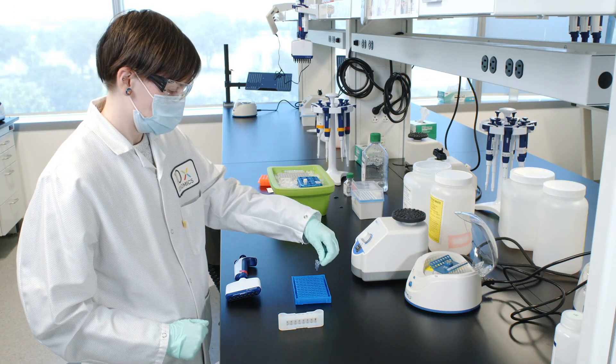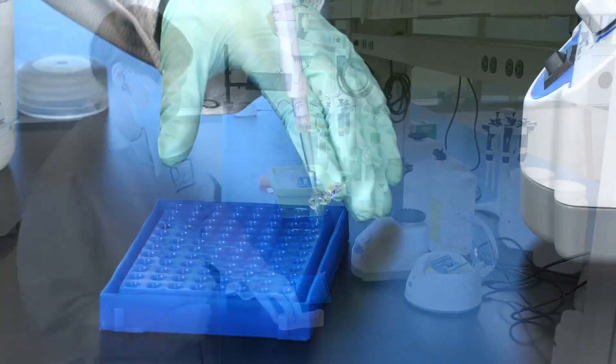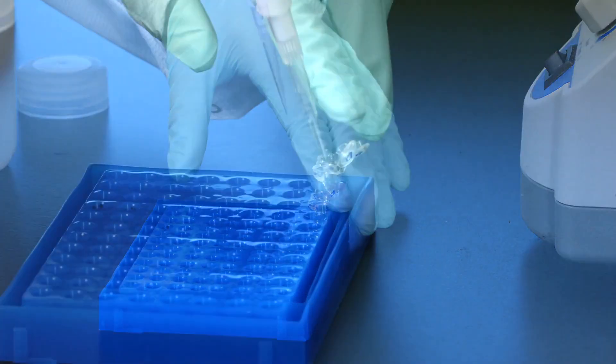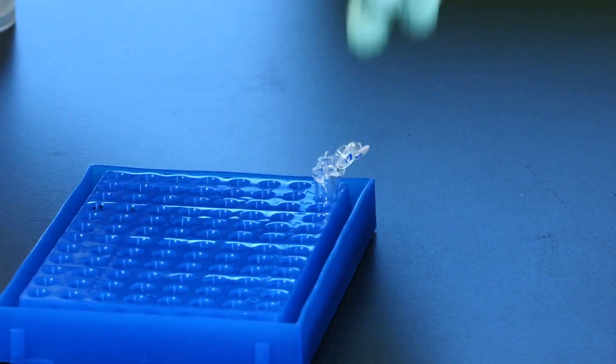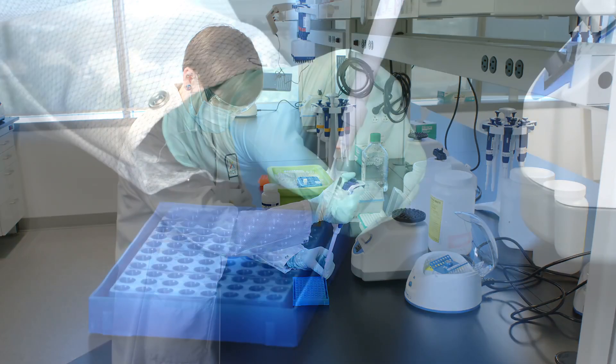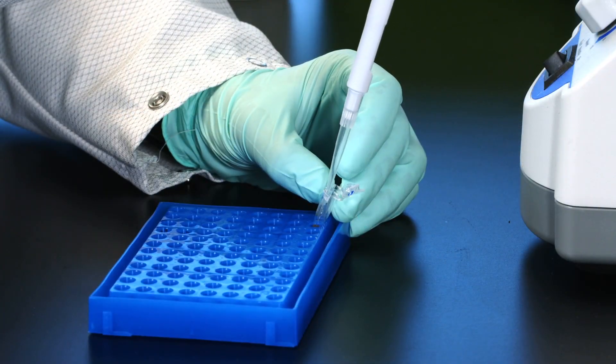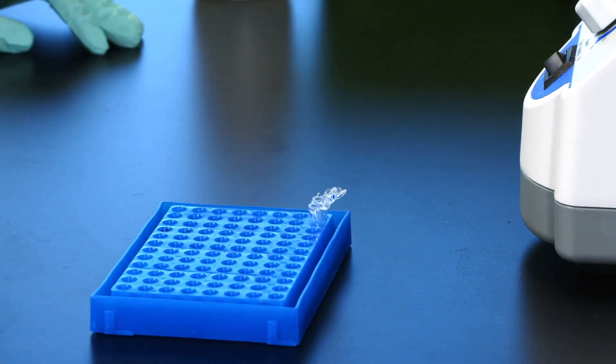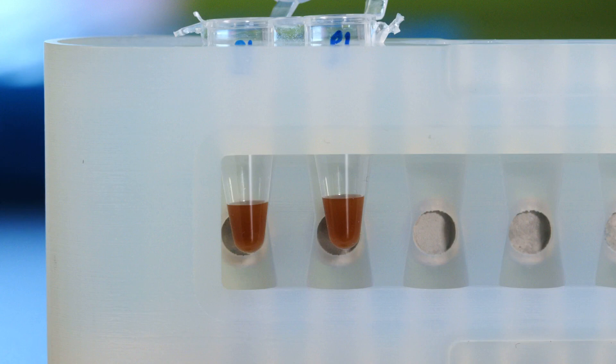Remove from the magnet. Add 27 microliters of buffer EB. Pipette mix 15 times. Incubate for 2 minutes at room temperature. Place on the magnet in the low position until the solution clears.